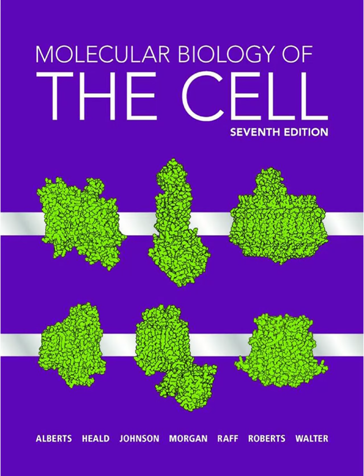This causes the light to undergo total internal reflection. It basically bounces off the interface instead of passing into the sample. So no light goes into the cell. How do you excite anything? Well, not quite no light.